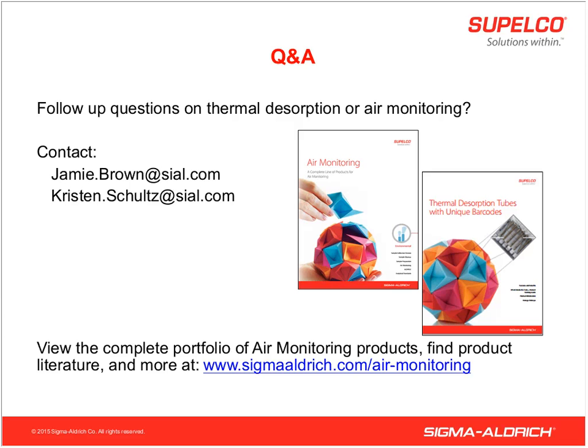Our first question is, how many times can you reuse a thermal desorption tube? That's a good question. Typically, we recommend a lifetime of about 50 sampling and desorption cycles. If the samples are really clean, sometimes we can push that another 25. And if we're sampling in very dusty environments, we might only get 25 cycles out of a tube.